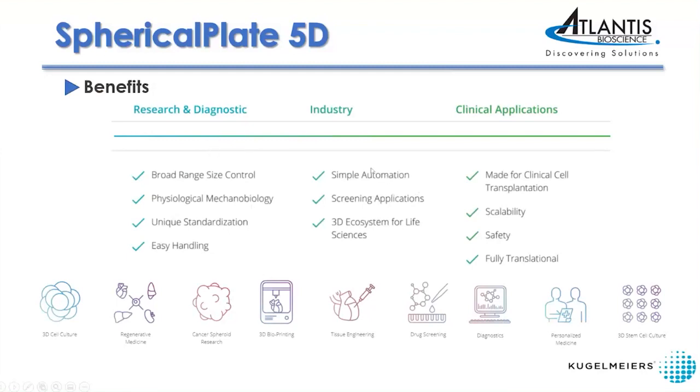So let's take a look at the video here. This is a time-lapse video showing the formation of the spheroids over a couple of hours. You can see across the microcavities, the spheroid formation is rather uniform throughout.